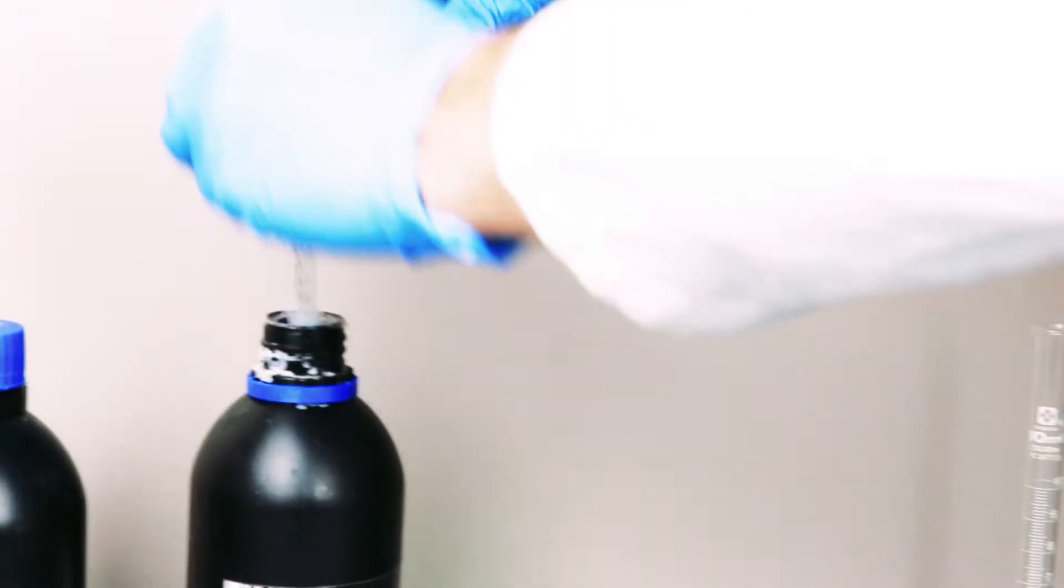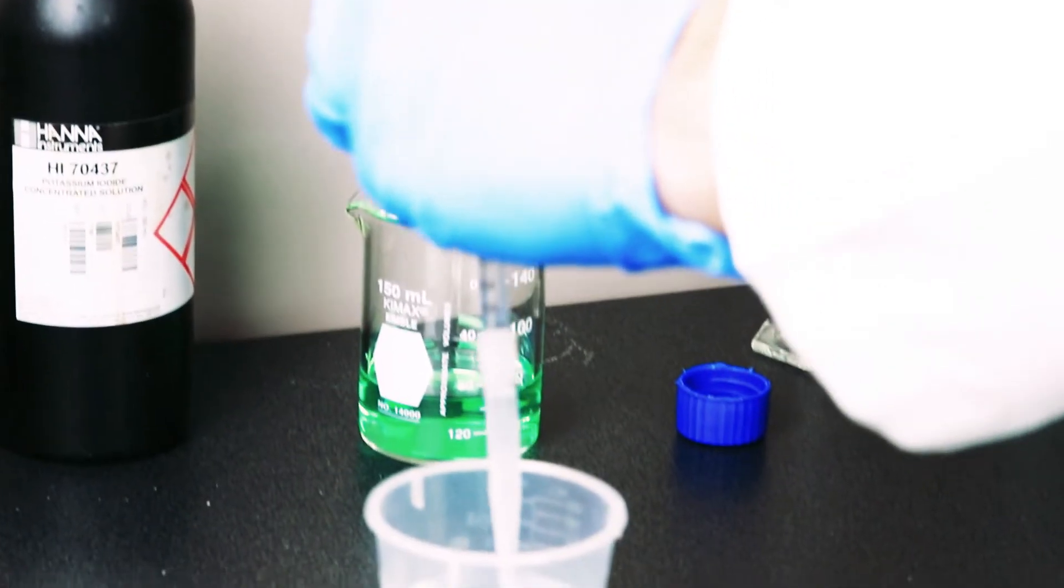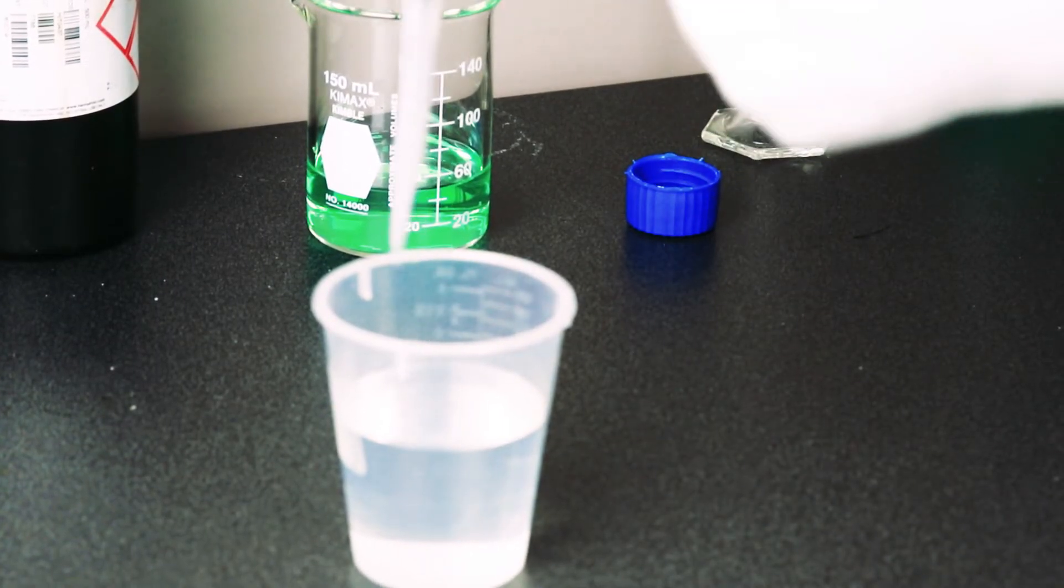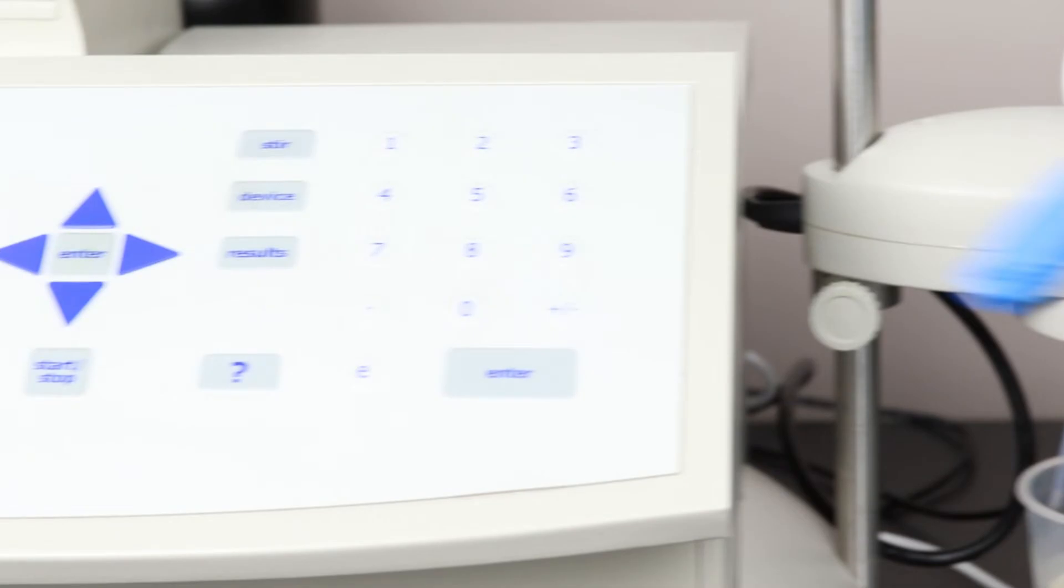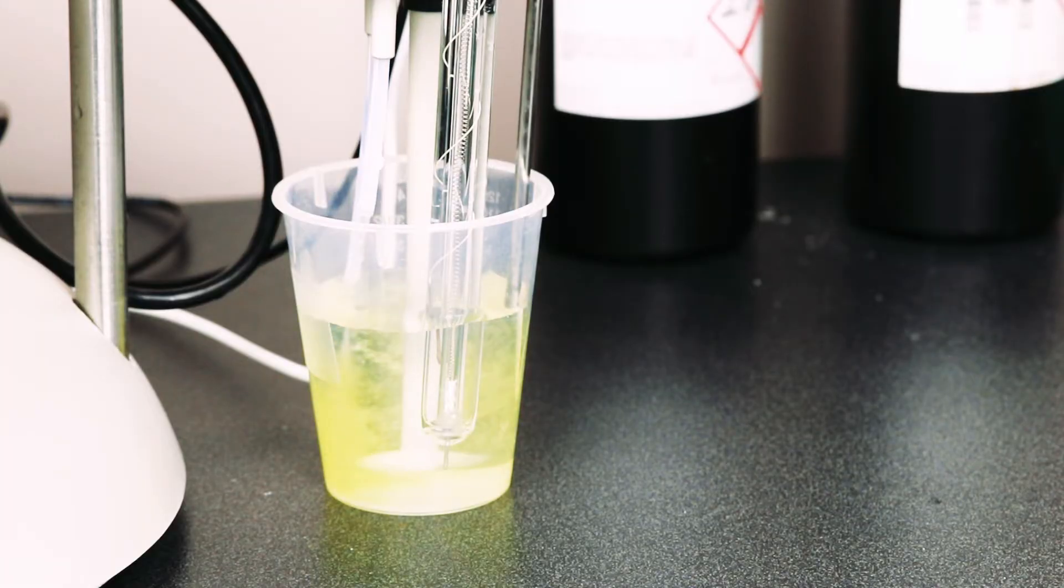Next, add 2 milliliters of potassium iodide to the sample. Place the beaker under the dosing tip and press start. The titrator automatically doses the first titrant, iodine, in excess.